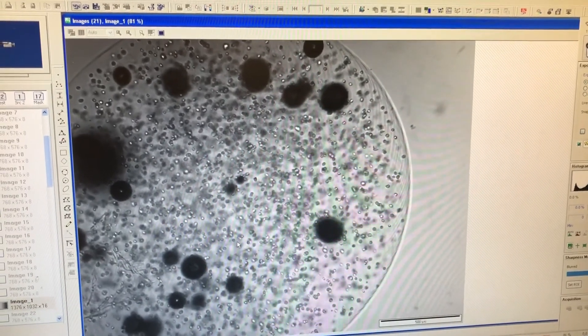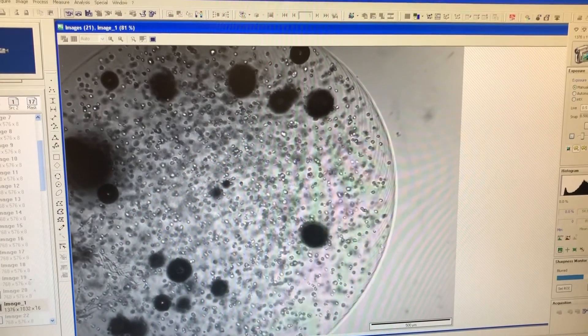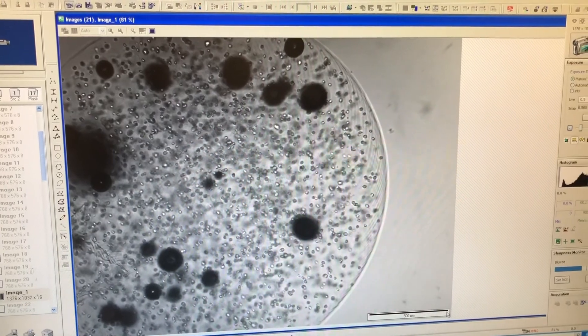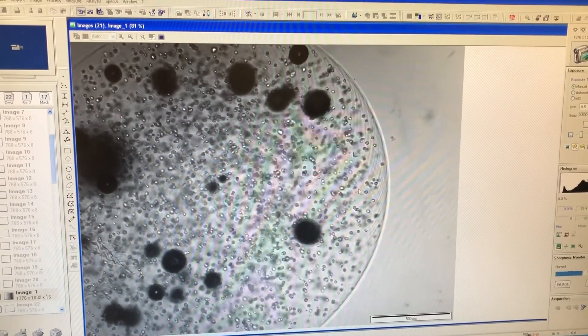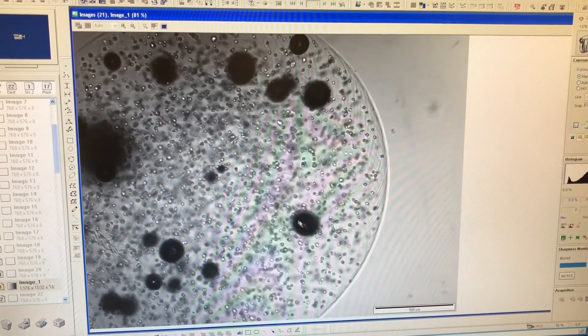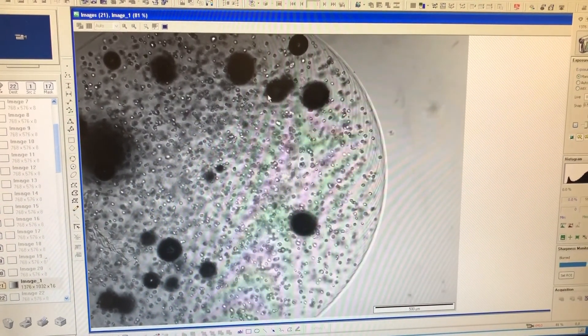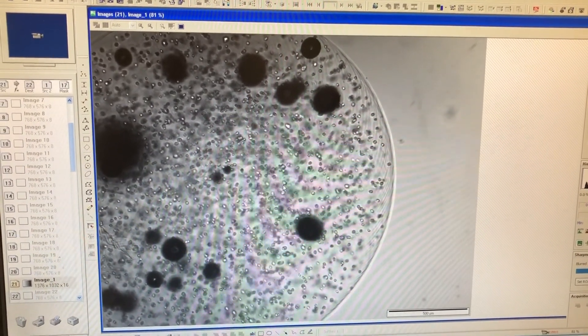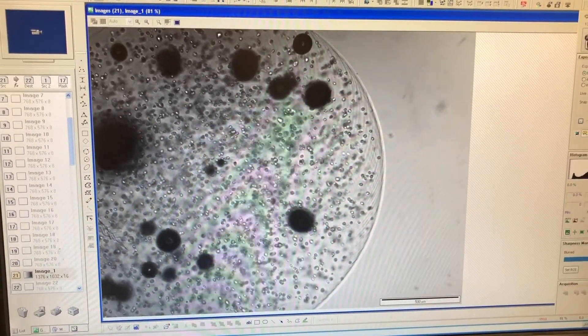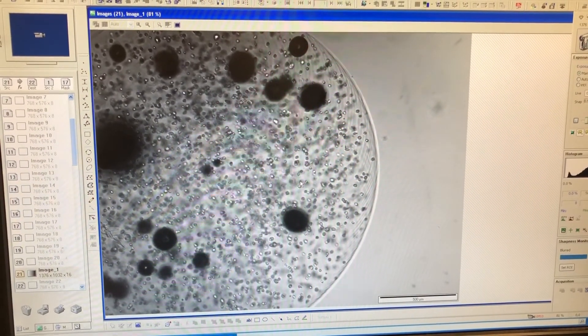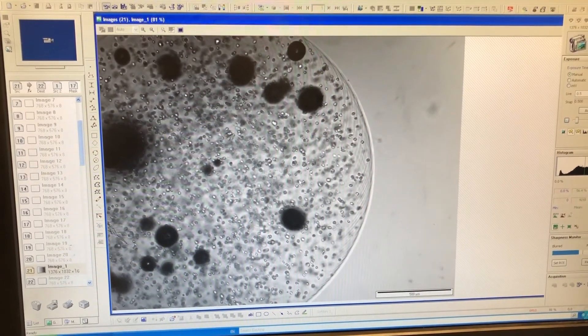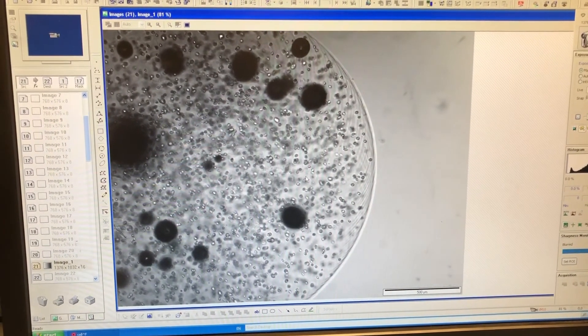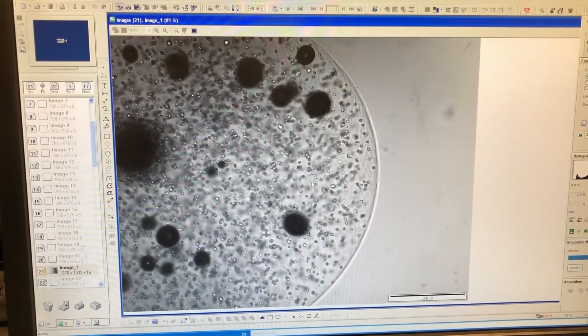Okay, so this is the alginate bead that we've just made and this is the outline of the alginate bead. We're looking on a four times lens and on this particular microscope you can see there's a scale bar of half a millimeter. So this bead is probably two or three millimeters across. These large black bits here are air bubbles, which I said I put some air bubbles in there by mistake. All of these little things down here are individual cells. So that's one cell, that's another cell, that's another cell. Now what will typically happen is a lot of these cells will die. A minority of them will form spheroids and those are the spheroids that you're wanting to grow in your experiments.